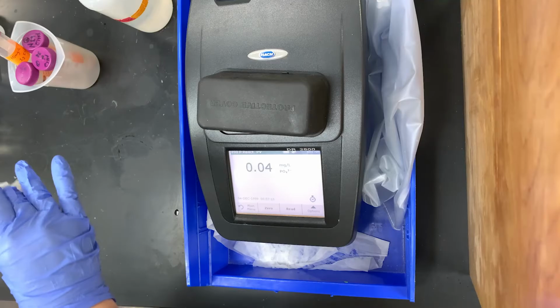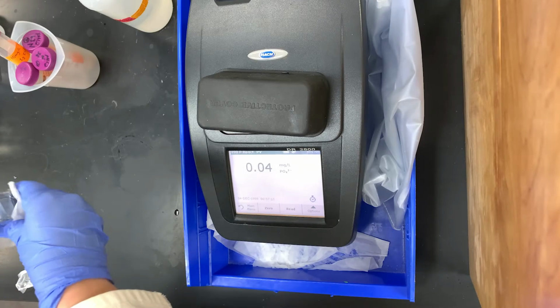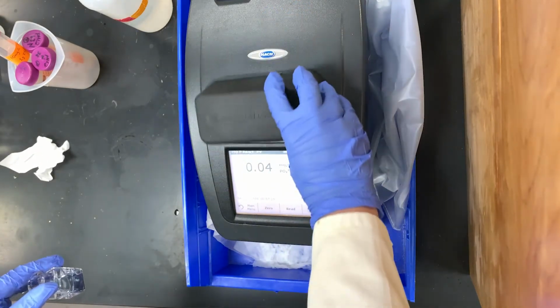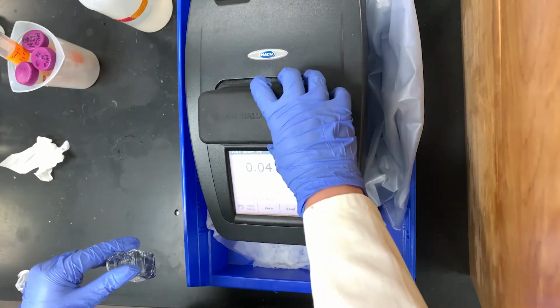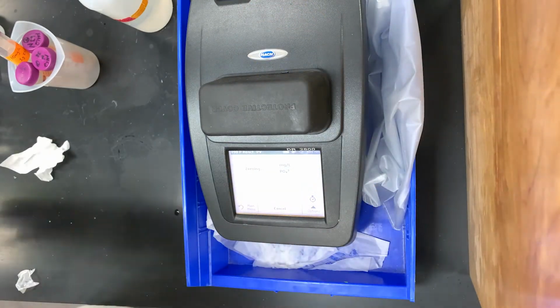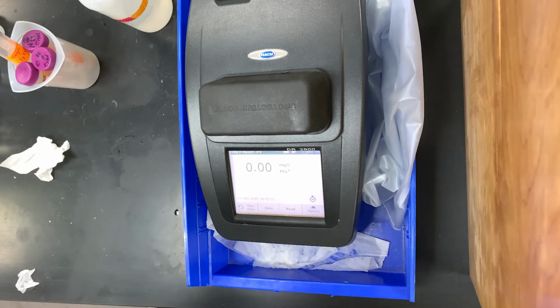So again, we're just doing the same method of adding the 10 mils of sample to each cuvette, adding the reagent into one of them, and waiting the 2-minute reaction time. So there's no dilution on this sample either for the final concentration, so we'll just put our blank in and press 0.